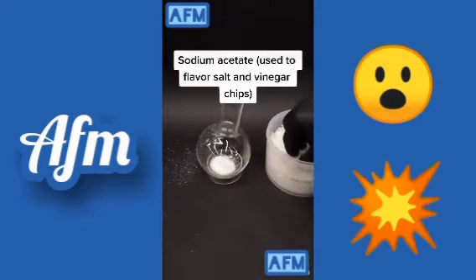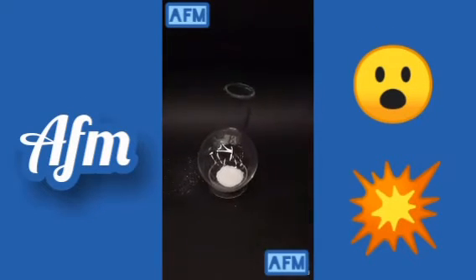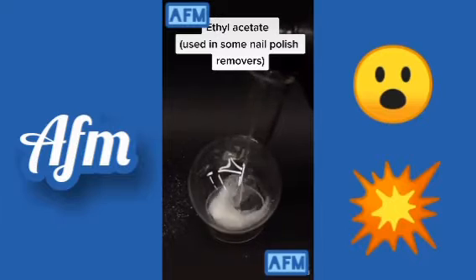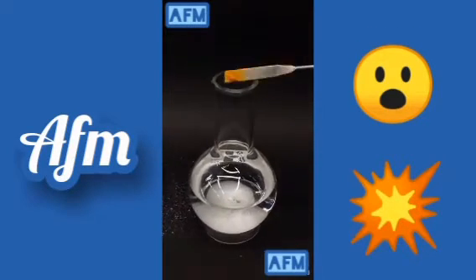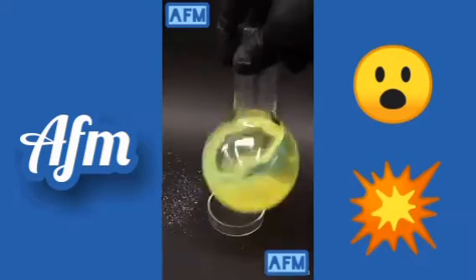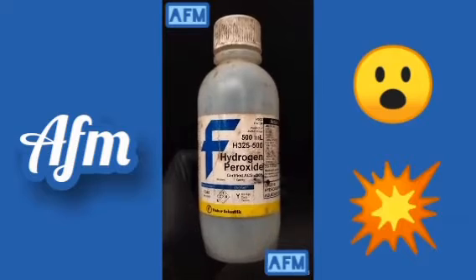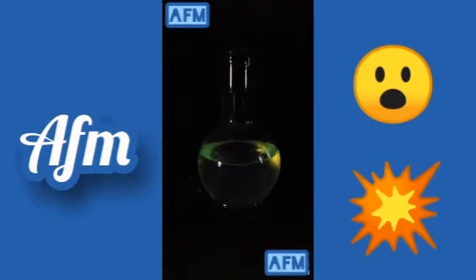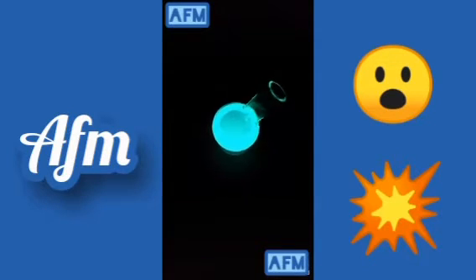Then we add a sprinkle of this, which is sodium acetate. Then we also add a solvent, ethyl acetate. Then we add some dye to it, which will give it its color. The last thing to add is some hydrogen peroxide. This is actually way brighter than I thought it would be. But anyway, this is probably going to keep glowing for a while.